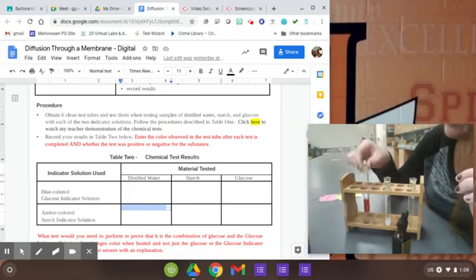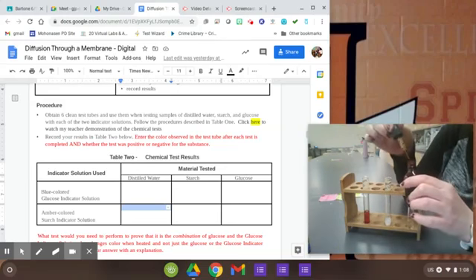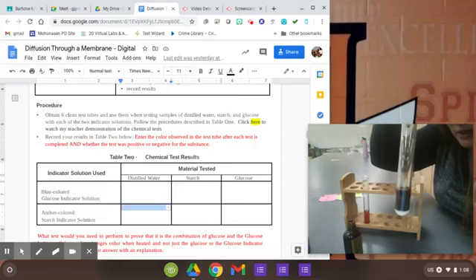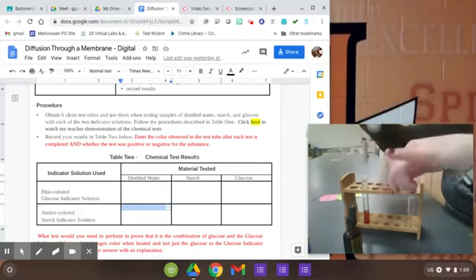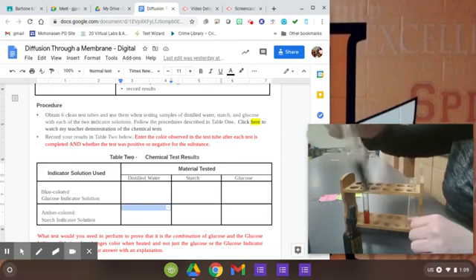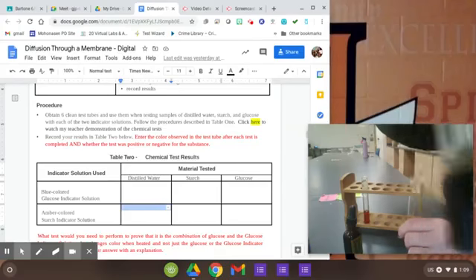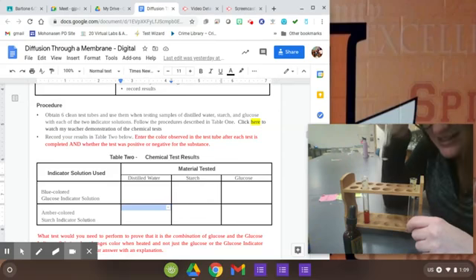That's the color. Okay. If we put starch indicator into starch solution, the expectation is that you would see a color change. And look at that. You certainly do. Now there's some starch settled at the very bottom of my test tube that it's not reaching, but if I shake it around a little bit, it probably will. But you can see it's changing to this black color. It is no longer that amber color, and it is now a black color. So that is a positive reaction.